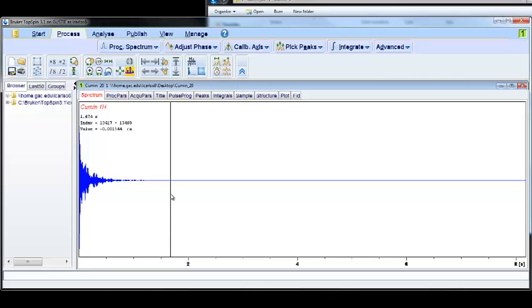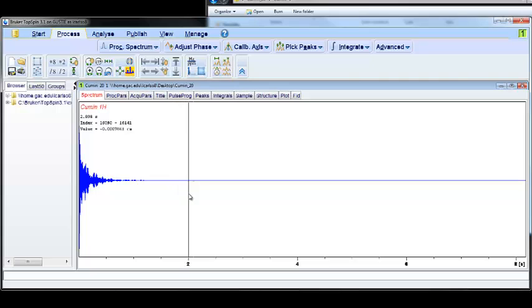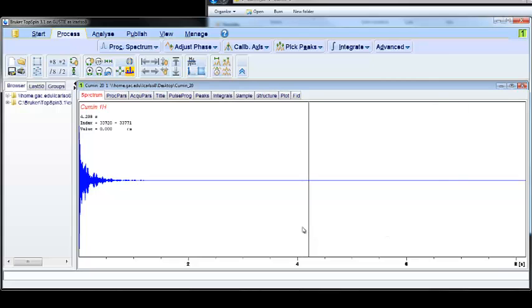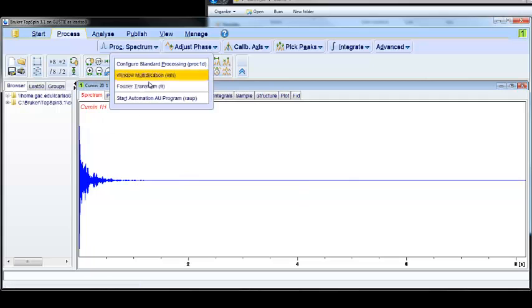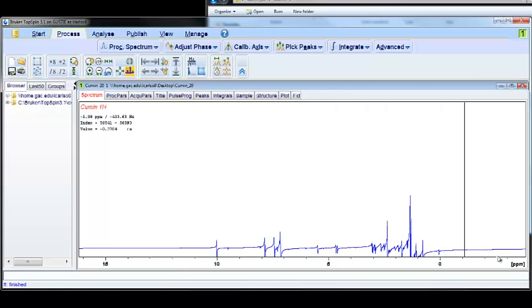The second thing that happens when we click the Process Spectrum button is a Fourier transform. You'll notice that an FID is in a time domain with an x-axis in seconds. A typical NMR spectrum that we're used to processing has an x-axis in frequency with units of either hertz or ppm. There's a mathematical function that converts time domains into frequency domains. If we arrow down to Fourier transform and click that, you'll see we now have an x-axis in ppm.